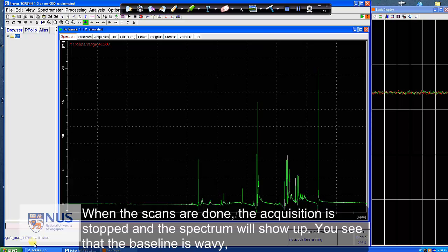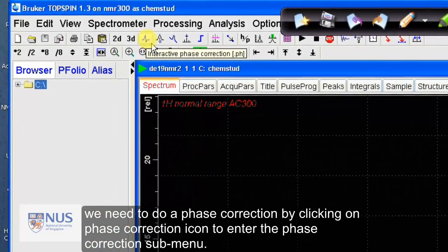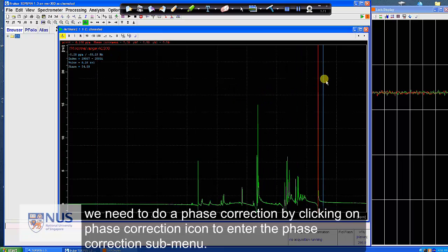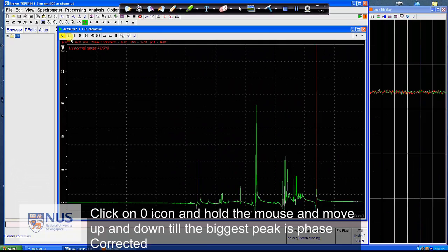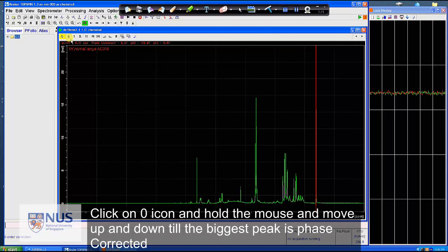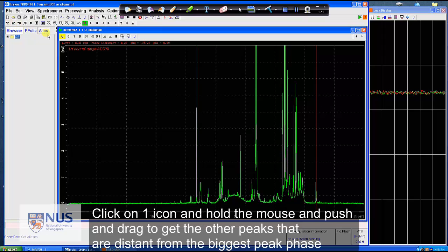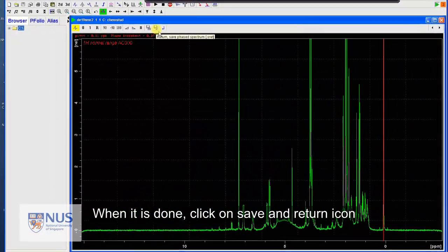You see that the baseline is wavy. Hence, we need to do a phase correction by clicking on the phase correction icon to enter the phase correction sub-menu. Click on zero icon and hold the mouse and move up and down until the biggest peak is phase corrected. Click on the icon 1 and hold the mouse and push and drag to get the other peaks that are distant from the biggest peak phase corrected. When this is done, click on the icon save and return.